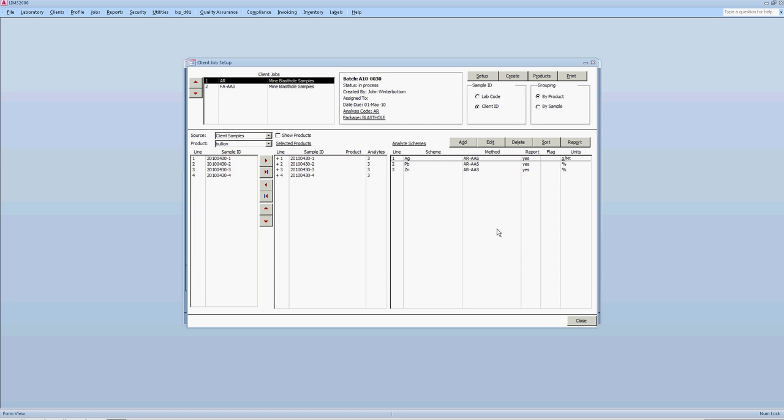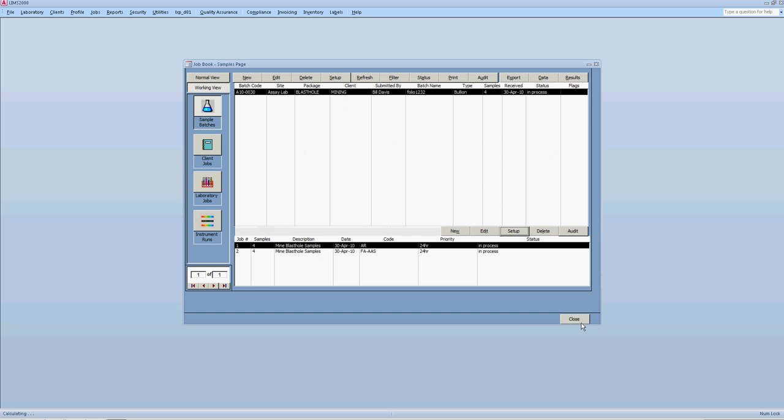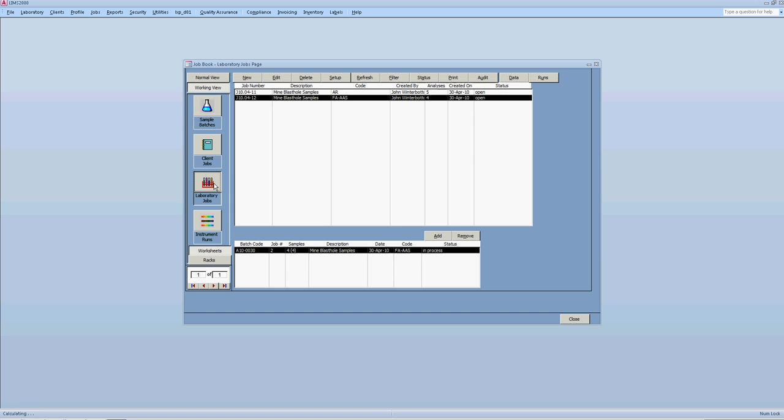And now we can view here in the setup screen of the client jobs. That you have two different types of analysis. One is aqua regia for those three metals. And the other one is, you select the next one. The next one is fire assay. Gold by fire assay AAS. Okay. So that's ready. The next step is you move to the laboratory jobs. And somebody will start entering weights when they weigh the sample.